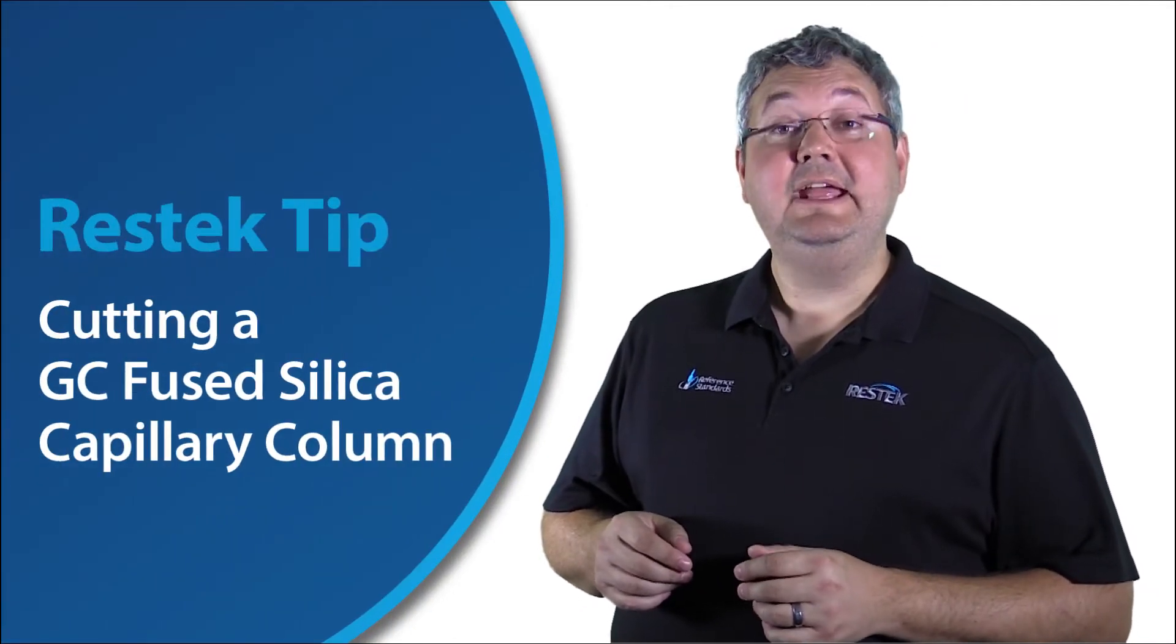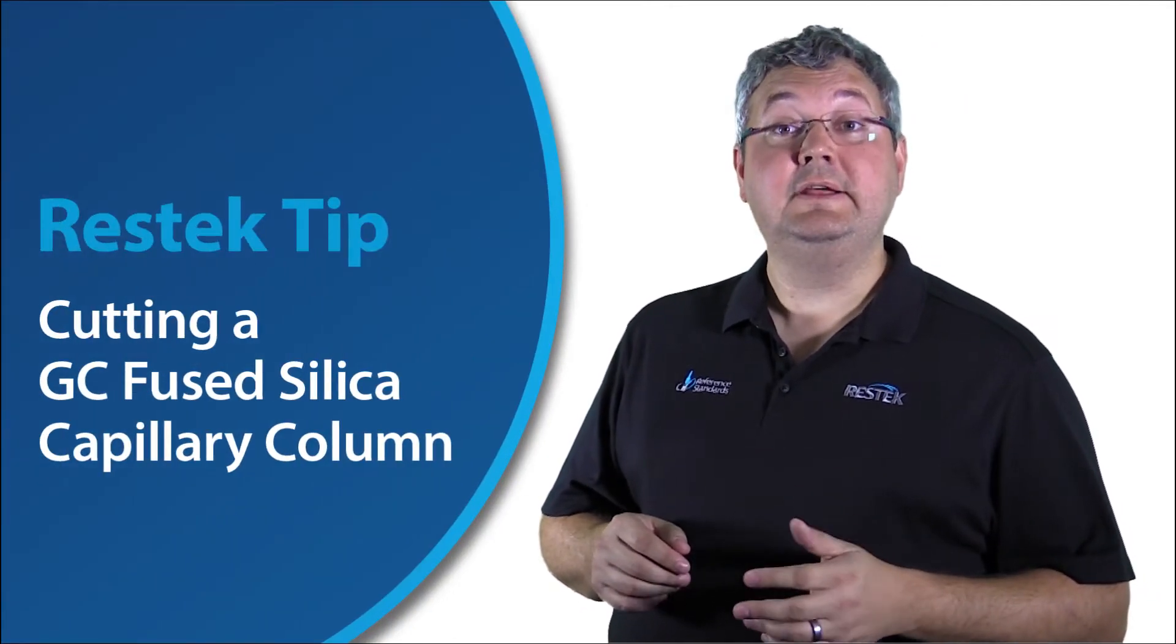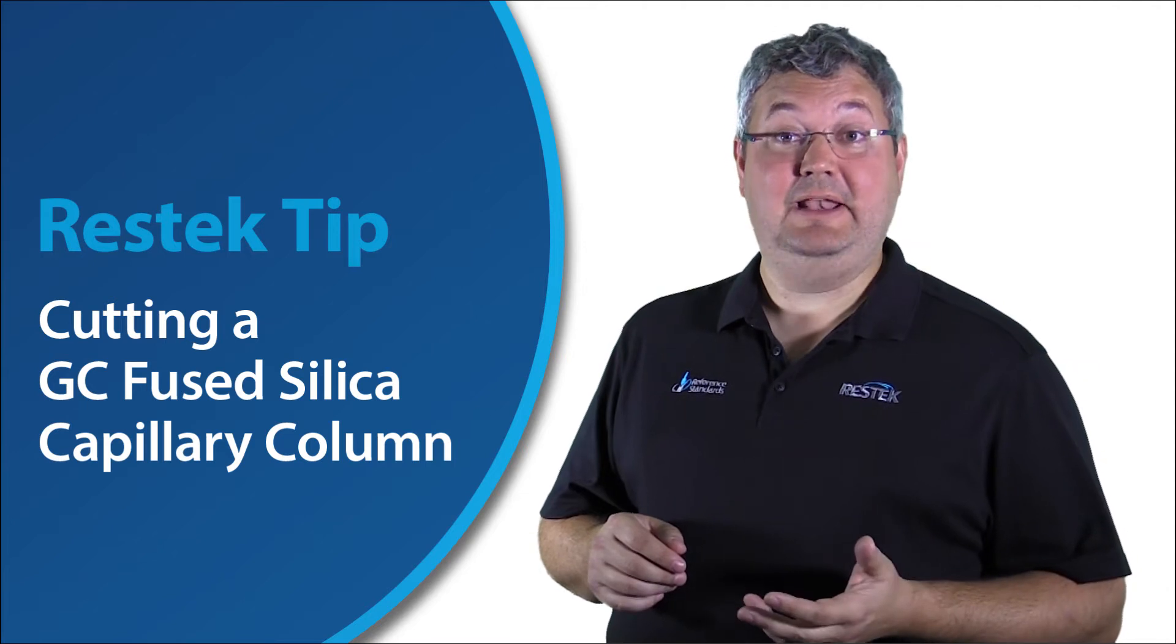Hello everyone, and welcome to another Restek tip. In this video, we are going to cut a GC fused silica capillary column.